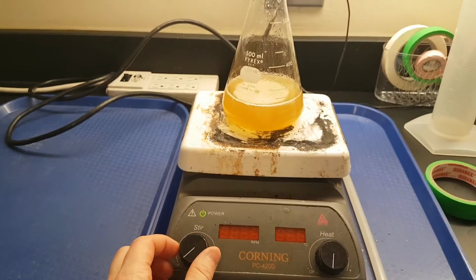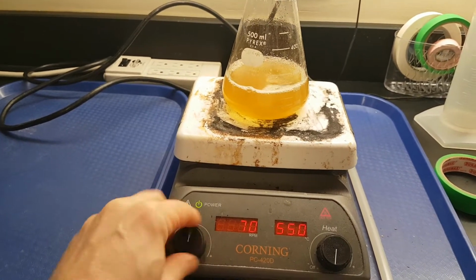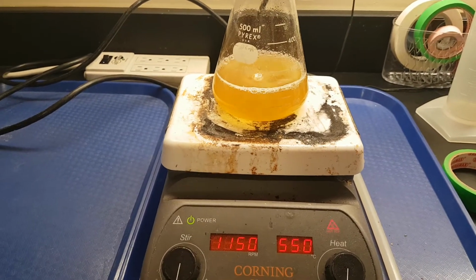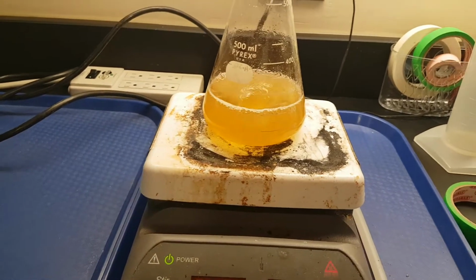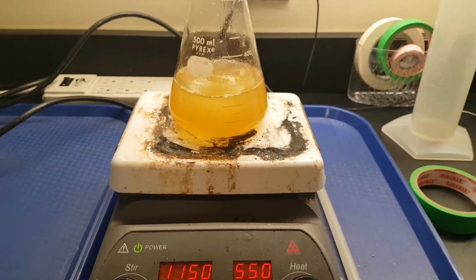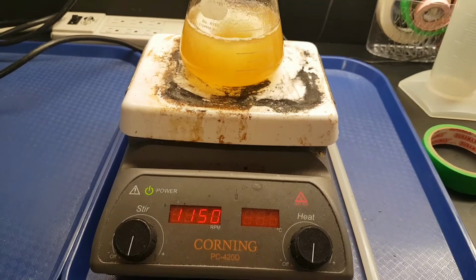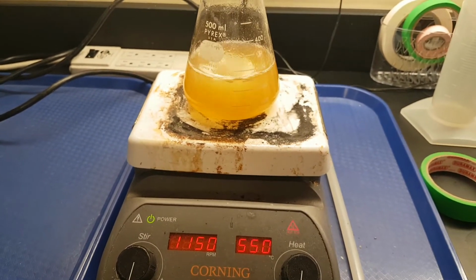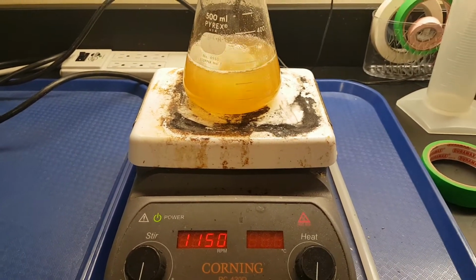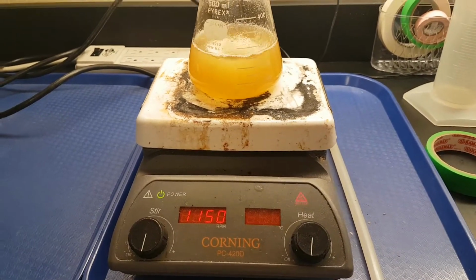One thing to note about this is that if you go from 0 to 1150, to the very highest on its stirring speed, if it's just sitting there, a lot of times what will happen is that it'll spin so quickly, it'll have a resistance against the water because that's also not spinning, and it'll start just hopping around. In which case, if that happens to you, then you need to turn it all the way off, let the magnet just settle in place, and then turn it up slowly. So here we go, and this is all at max. Again, you really don't need to do that, especially with such a small volume, but we bring this up to boiling, and then we are ready to move on to the next step.